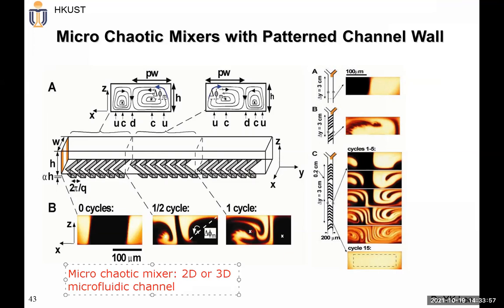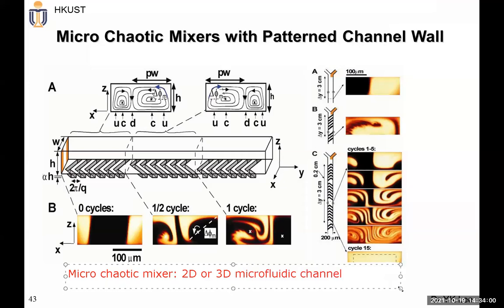So this is one of the things that is not easy, because to be able to do this kind of analysis and simulation requires a good understanding of mechanics, like fluid mechanics, also nonlinear dynamic systems, and then you are able to understand the chaotic behavior of a microfluidic mixer.